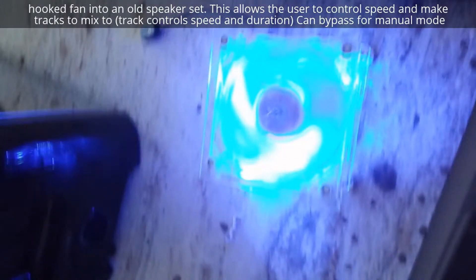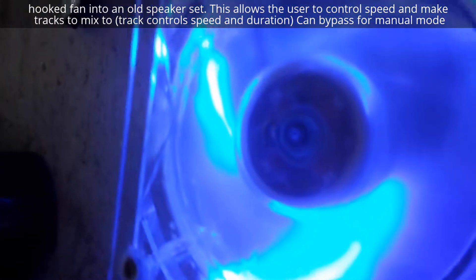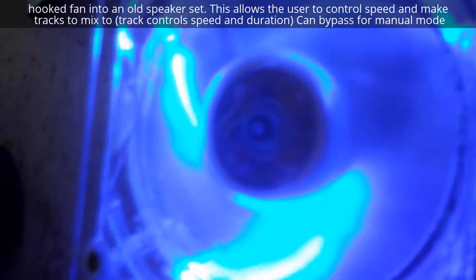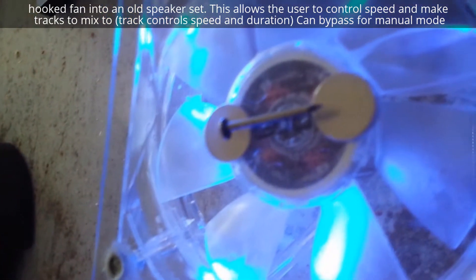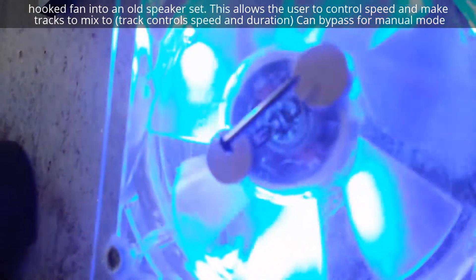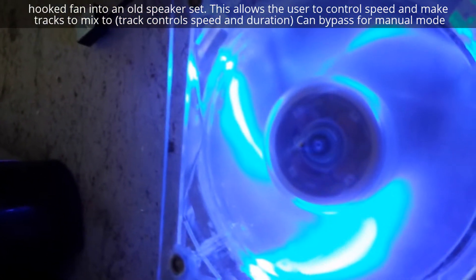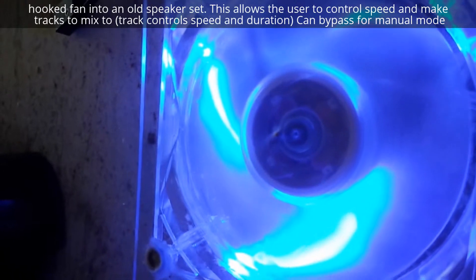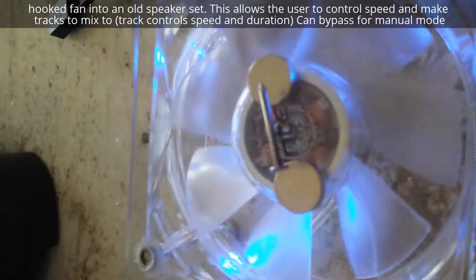So let's turn that on. And now I have a nail — I don't know if you can see that, it's probably moving too fast right now. The nail is spinning around right there. It gets stuck sometimes.